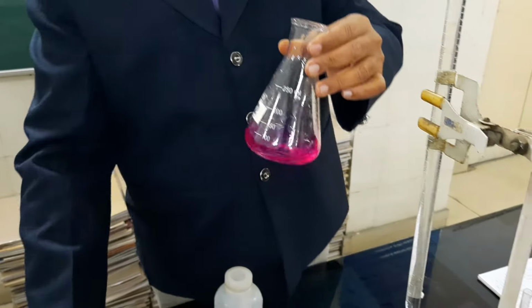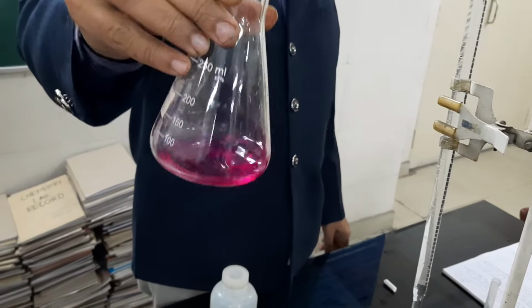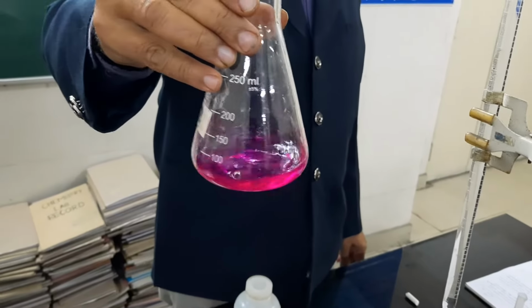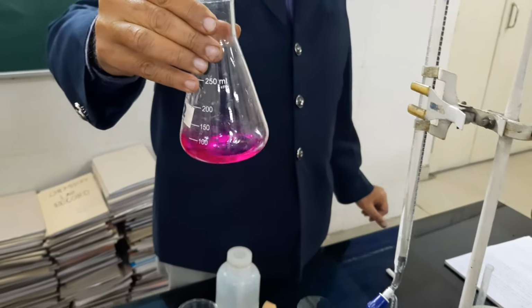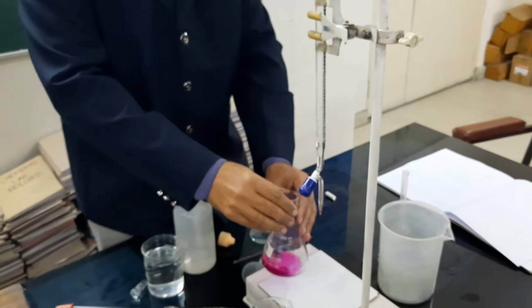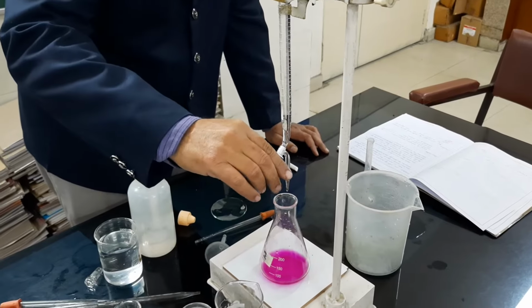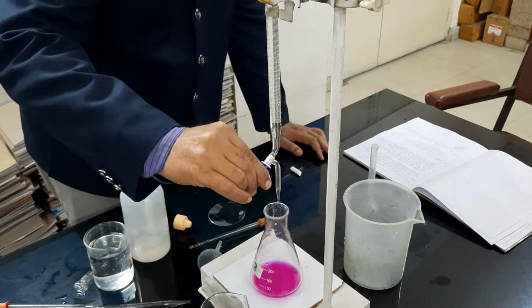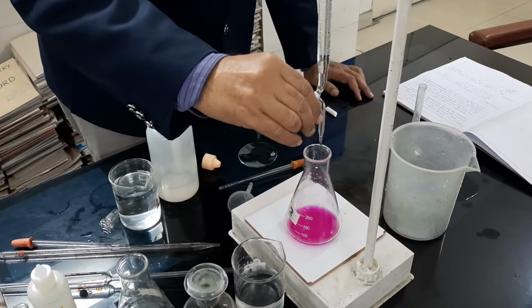You can see that a dark pink color has been developed in the solution. Now titrate this solution against N/10 HCl till the disappearance of this pink color.